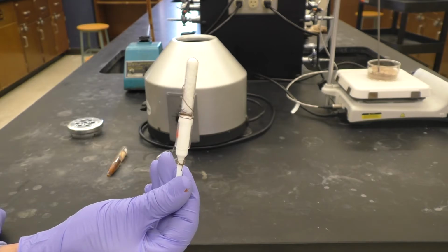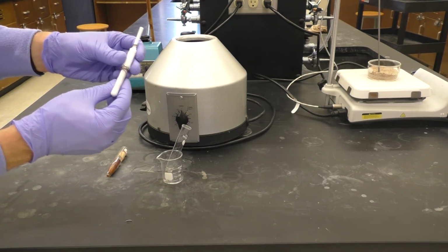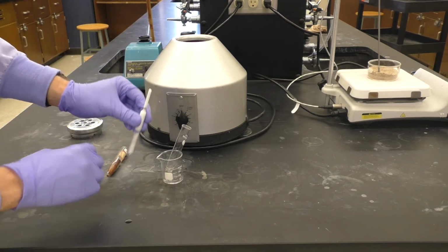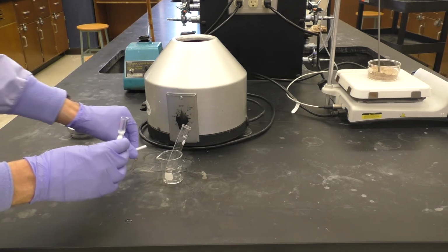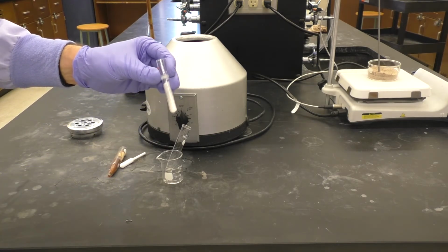So this is perfect. We are now done. We can re-invert the Craig tube, remove the copper wire, carefully remove the plunger, and now I have isolated my solid material from the Craig tube.